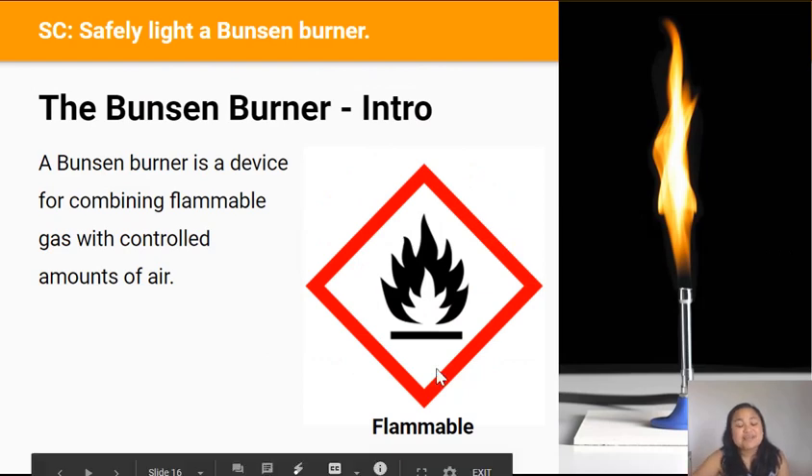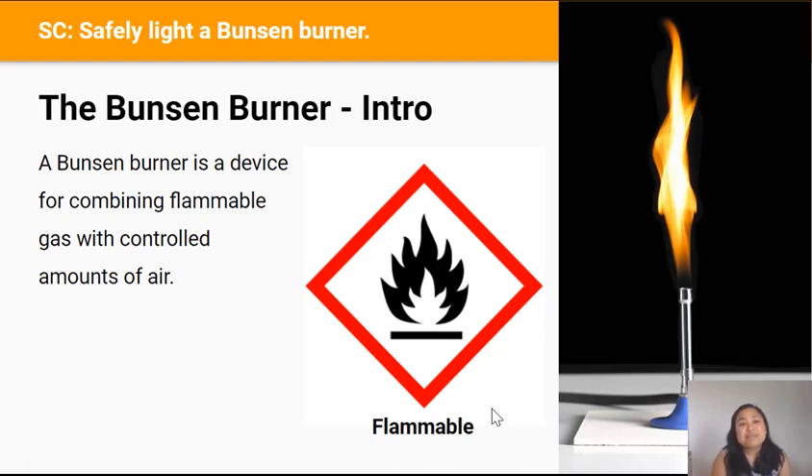Do you remember the symbol for something flammable? In this section we're going to talk about flammable gas — a gas that can easily catch on fire when mixed with oxygen. A Bunsen burner is a device that combines flammable gas with controlled amounts of air to produce a flame, which we use to heat things in the lab. The Bunsen burner was named after a man called Robert Bunsen, after initial designs by previous scientists.